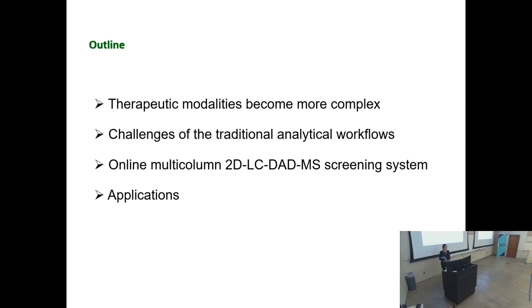Then I will introduce our online multi-column 2D-LC with diode array and mass spec screening system. Finally, I will give some applications for this new tool.